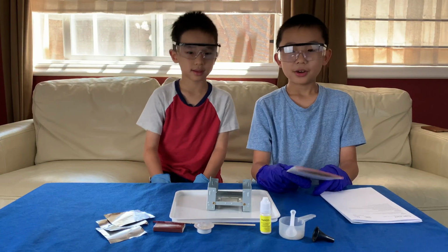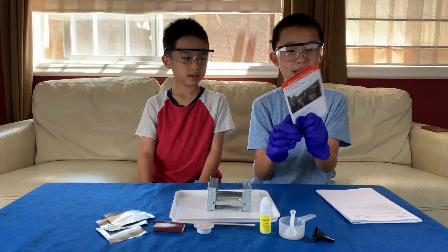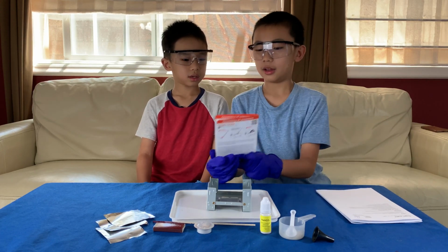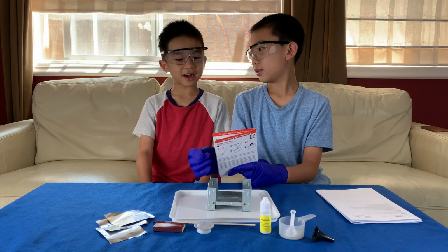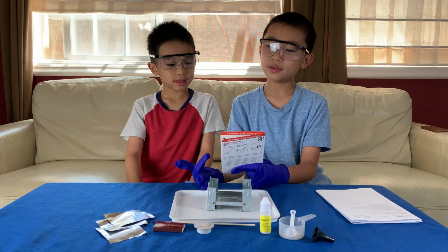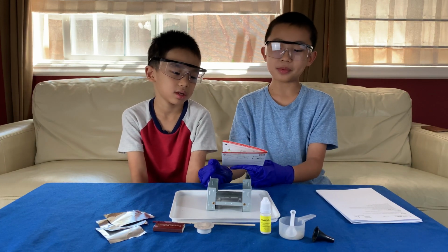We're back and we're set up for the next experiment, which is the sugar snake. Okay, so this has a difficulty of 2 out of 3, a danger level of 3 out of 3, that's the most dangerous, and it takes 30 minutes.